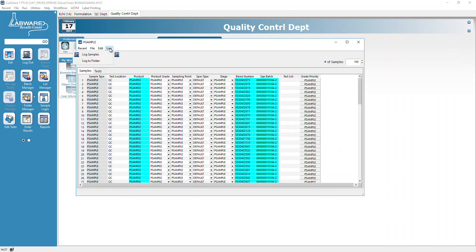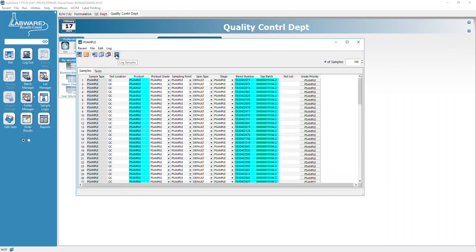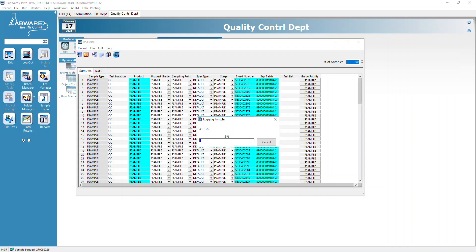At that point, I've got my samples all prepared and now I'm going to go to Log, Log Samples. You can click Log Samples here or here. This is going to take some time.